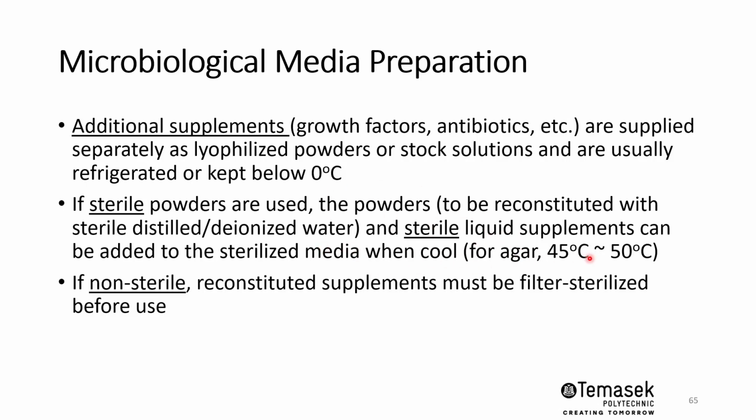And for agar, when it's still molten, it's around 45 to 50 degrees. In contrast, if the supplements are reconstituted but they are non-sterile preparations, and you need to add them to a sterile media, then what you can do is filter sterilize these supplements first before adding.